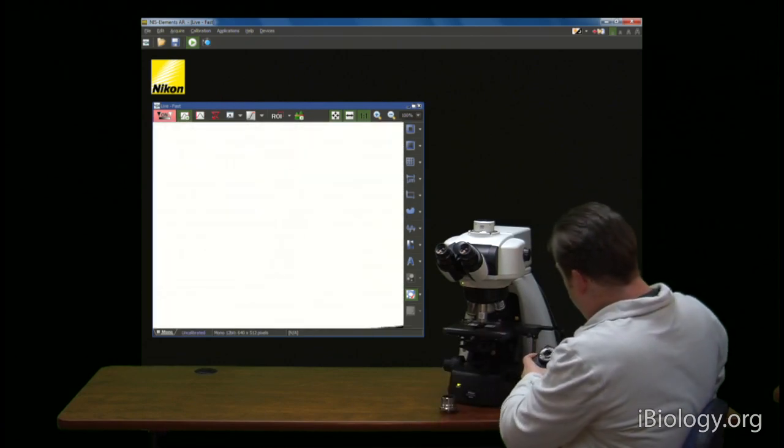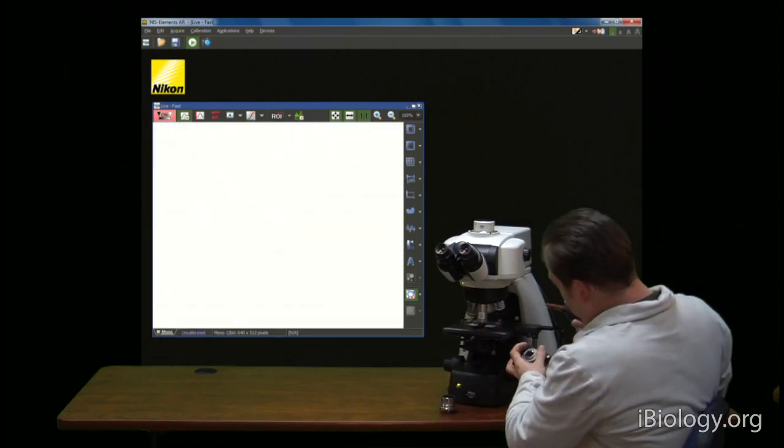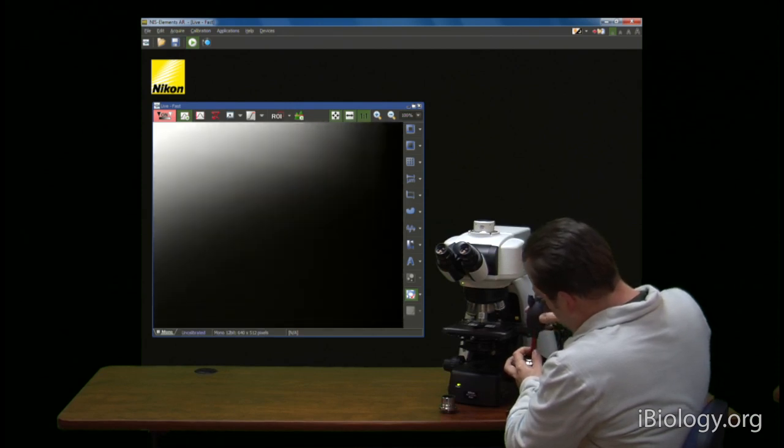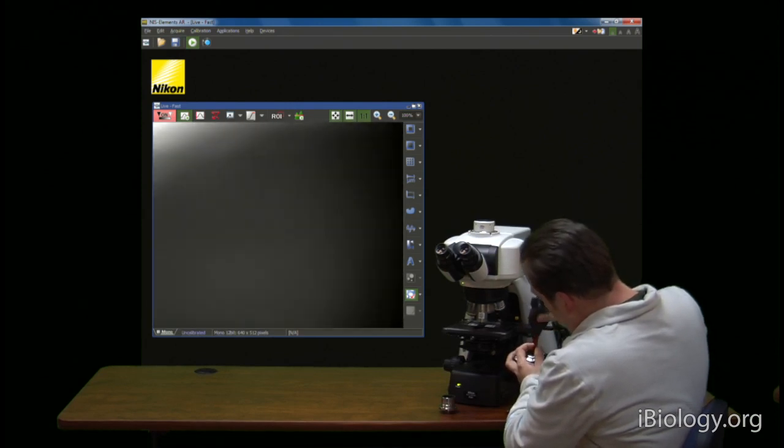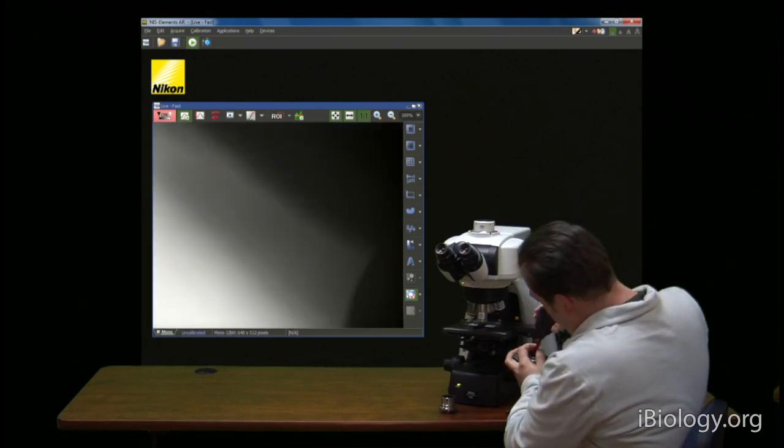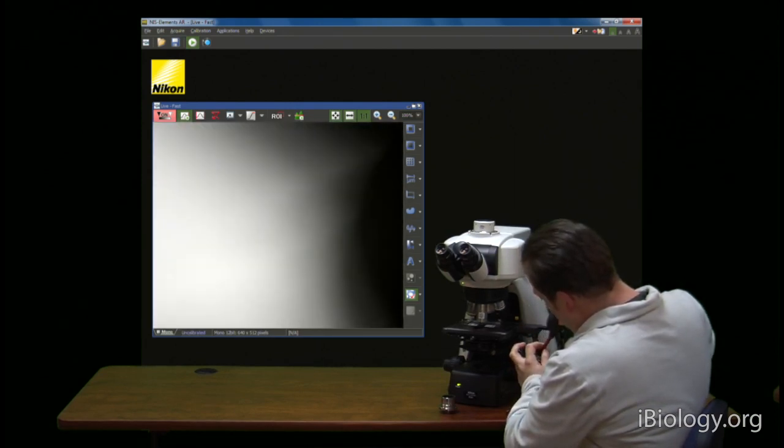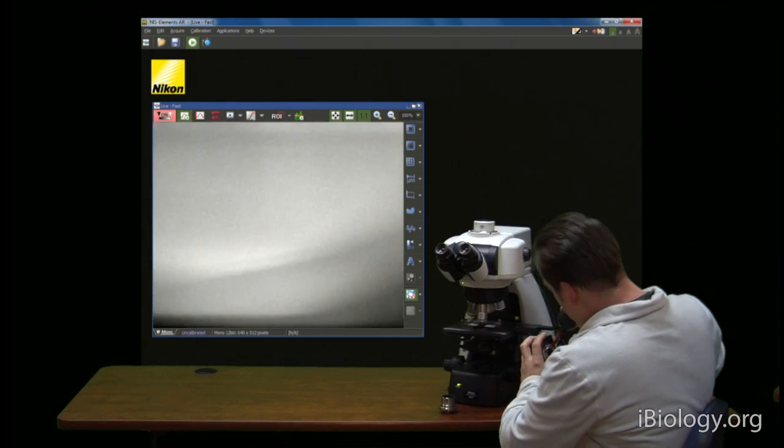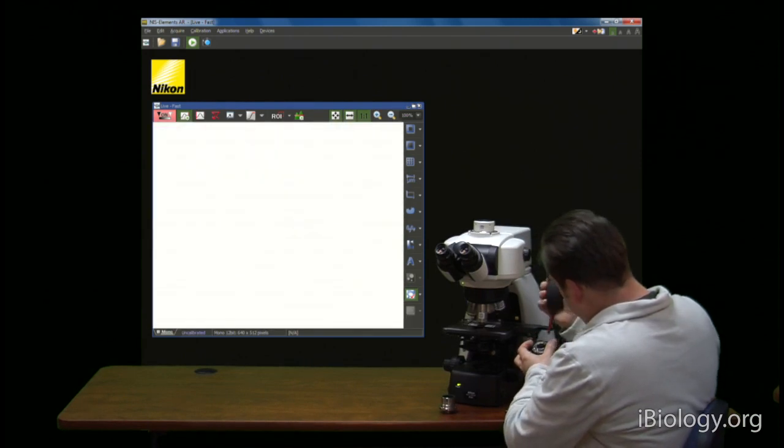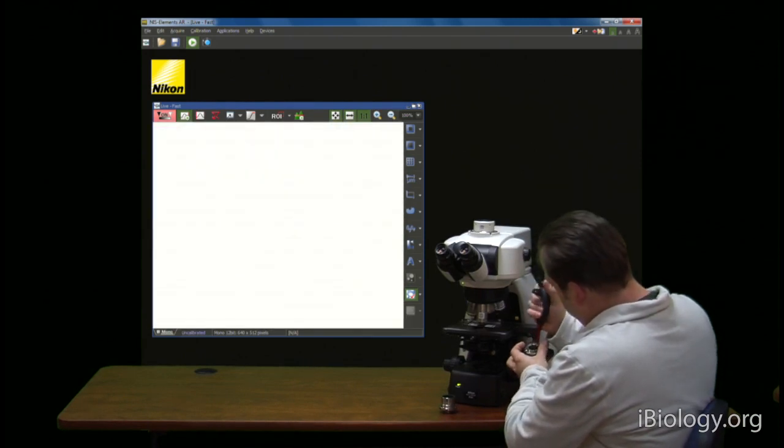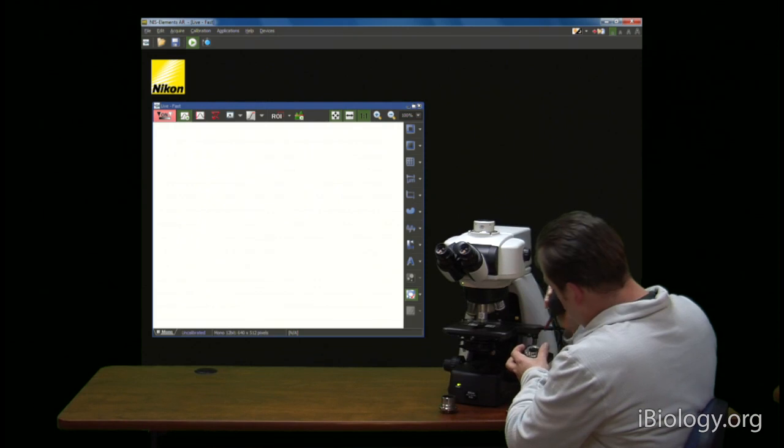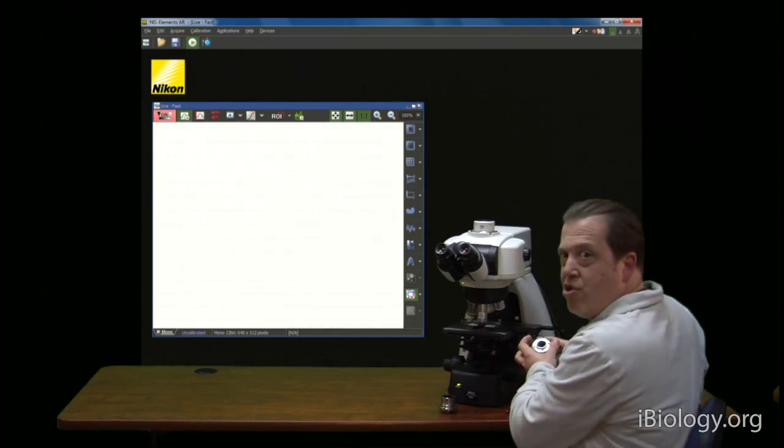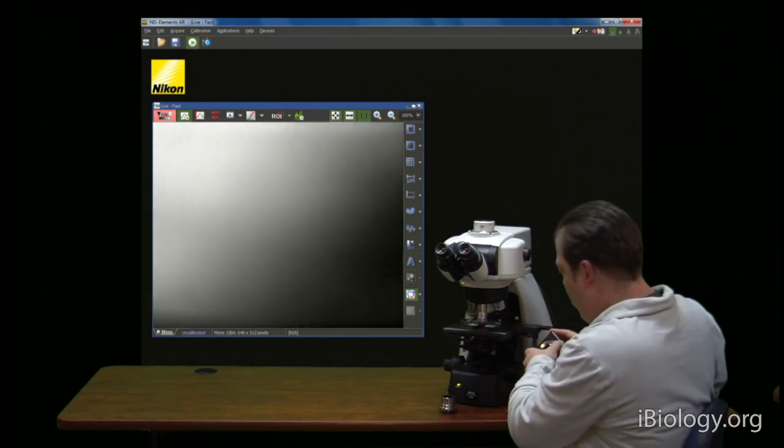And I'll take an air duster and blow away the dirt that's on the chip of the camera. So that should have made a big difference.